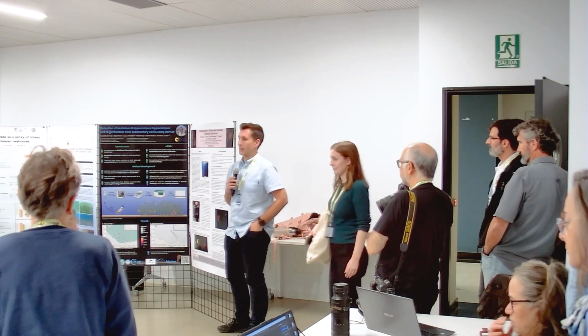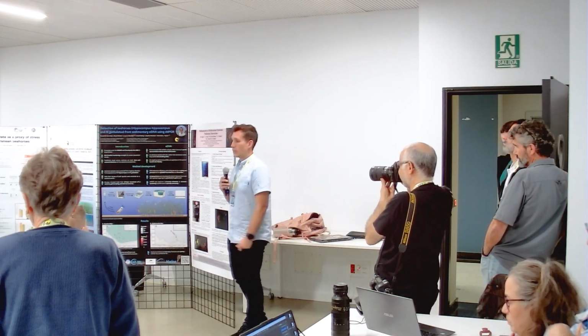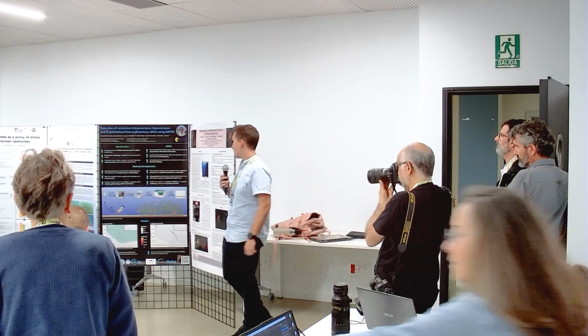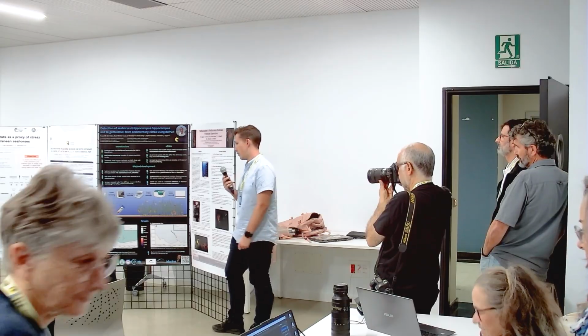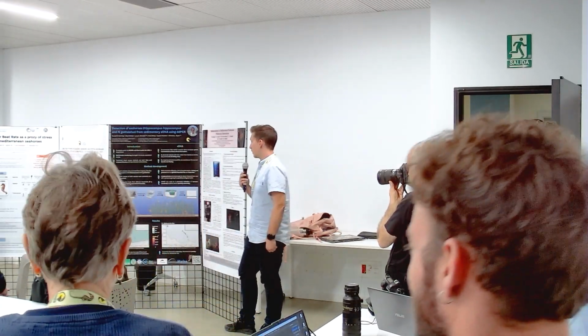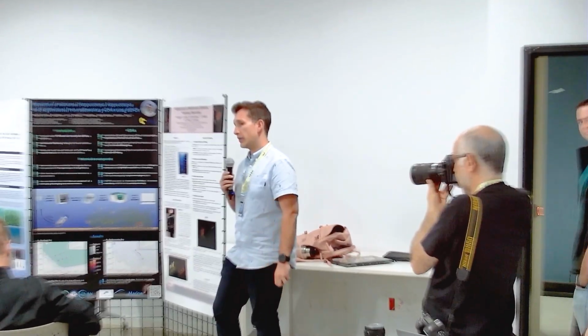...is needle in a haystack scenarios. So we have that toolkit, and that is environmental DNA as well. What we can do is target the sedimentary eDNAs, because seahorses are always found within the benthic region in the area. So what we move on to is more of the method development section.